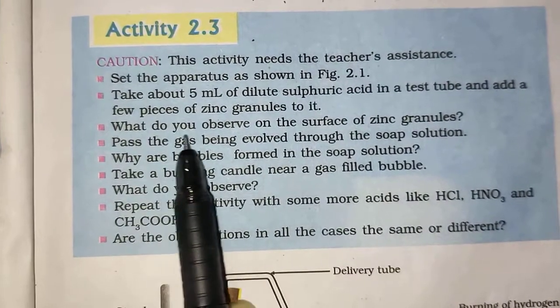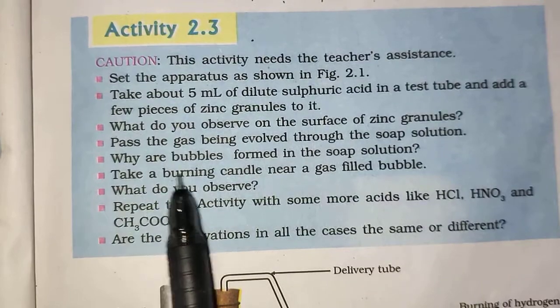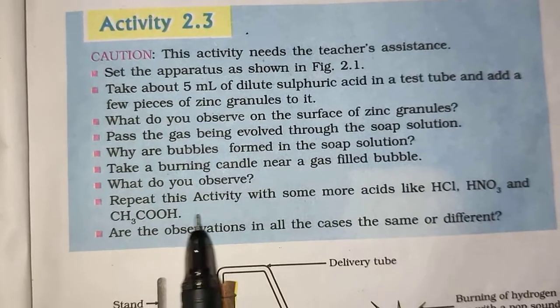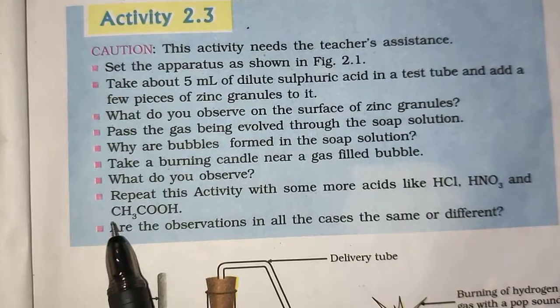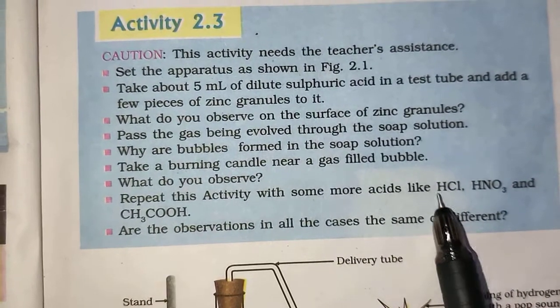So what will happen? Repeat this activity with some more acids: HCl, HNO3 and acetic acid. This is acetic acid, HCl and HNO3.